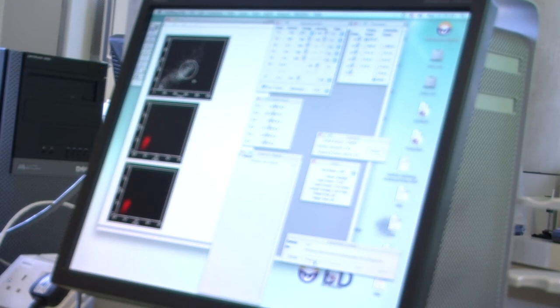Because what we don't know is what these cells are. Well, obviously, some of us do, but you don't. So you have to derive all of your information based upon what you get from the flow cytometer. Now, what you're not getting is a little label popping up saying these are fibroblasts, or these are epithelial cells, or these are lymphocytes. You haven't got that. You can only extrapolate that data from the information you get. But there is quite a marked difference in forward and side scatter between the first sample and the other two. So that alone tells you something.